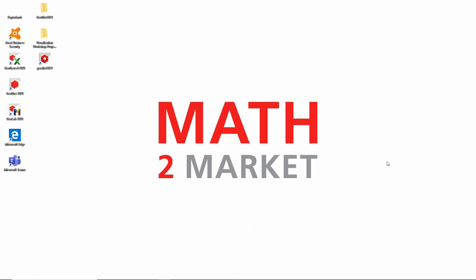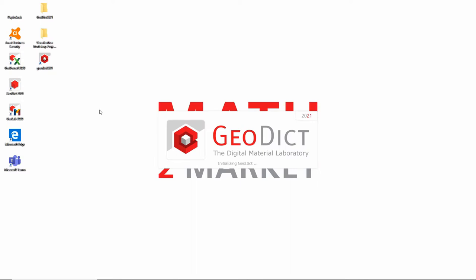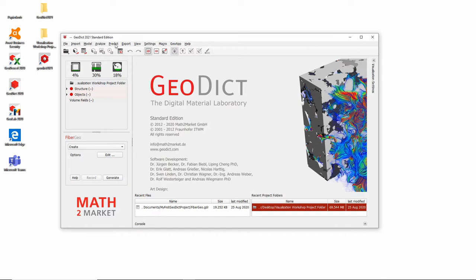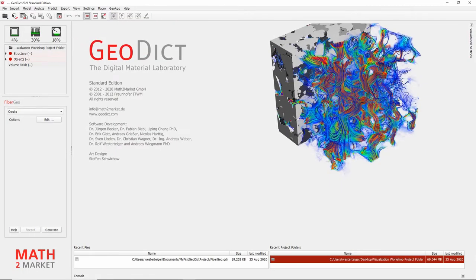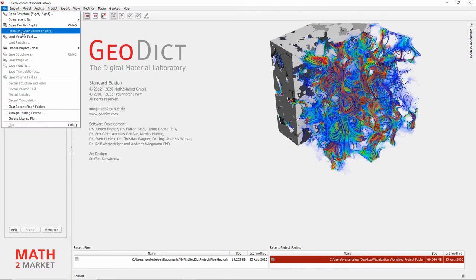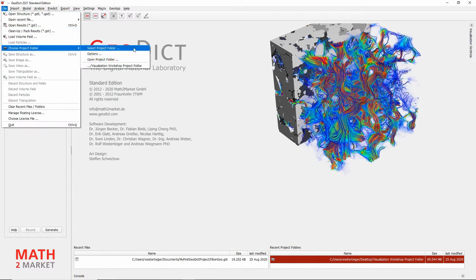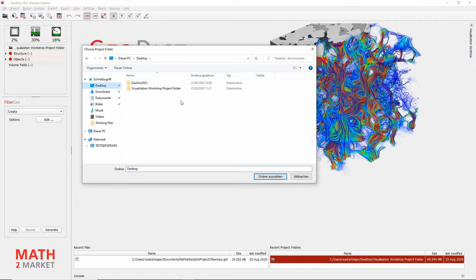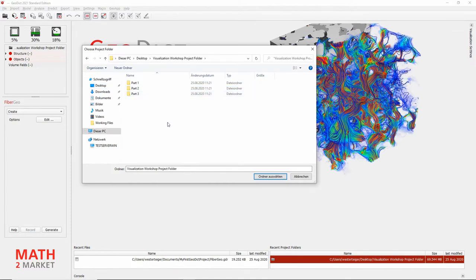Without further ado, let's dive right into part one. Please start GeoDict 2021. You should have received the workshop materials folder. The first thing we want to do is change GeoDict's project folder to this folder. So please click File, choose Project Folder, and select Project Folder. Then navigate to the place where you have stored the workshop materials and double-click into the visualization workshop project folder. This folder contains both the raw image data for visualization inputs as well as all the outputs — images and videos — that we will generate during this workshop. Please click Select Folder.